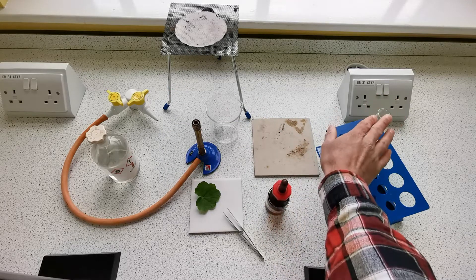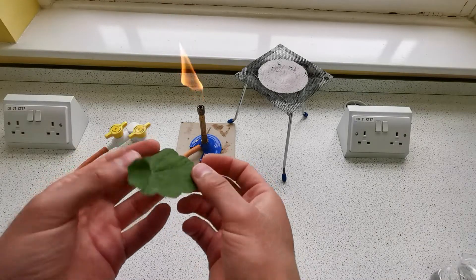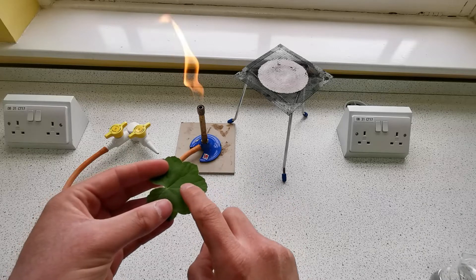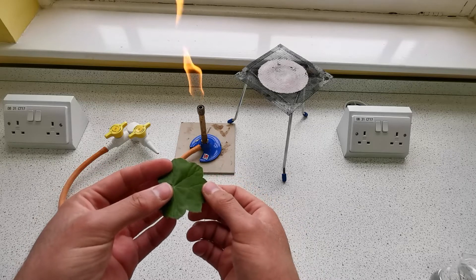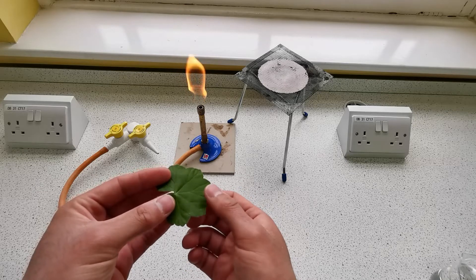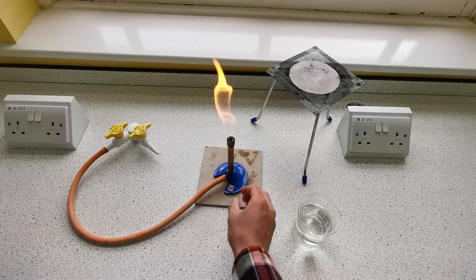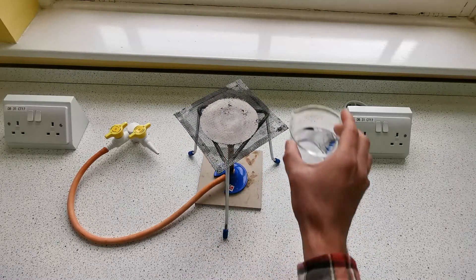The leaf is covered by a waxy cuticle which makes it waterproof and reduces water loss. In order to soften this waxy cuticle so that the iodine can be absorbed, we're going to boil the leaf in water for about 10 minutes. This also stops all the chemical reactions occurring in the leaf by denaturing the enzymes. I've got some water in a beaker and I'm going to use the blue flame to heat the water until it boils.